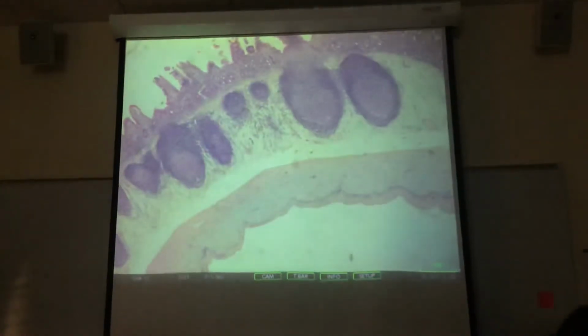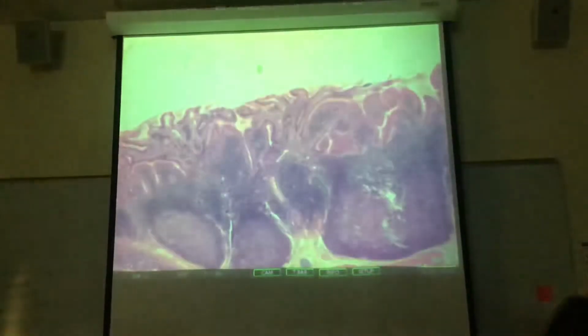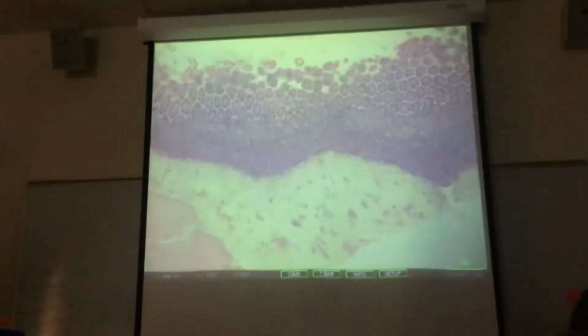Yeah, that's a nice one. So I'll use that one, and then we get an example of a bad one. I'll tell you when I'm in the slide.